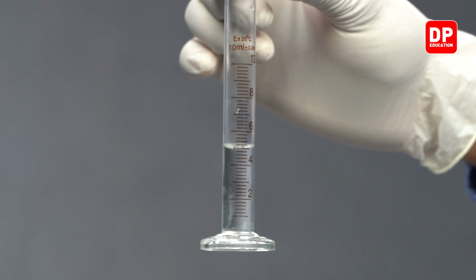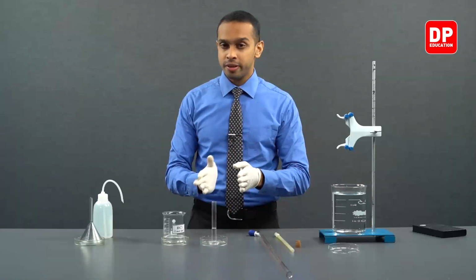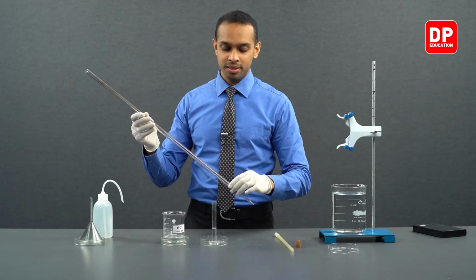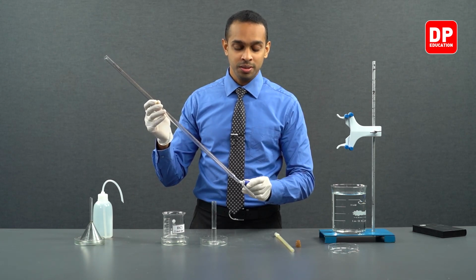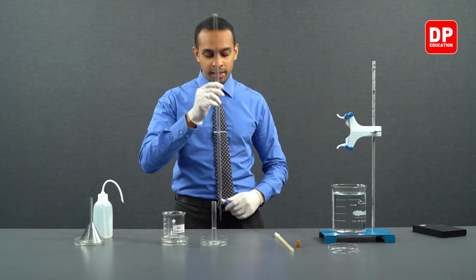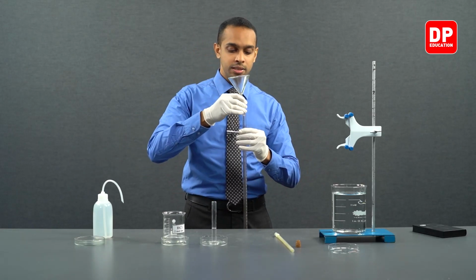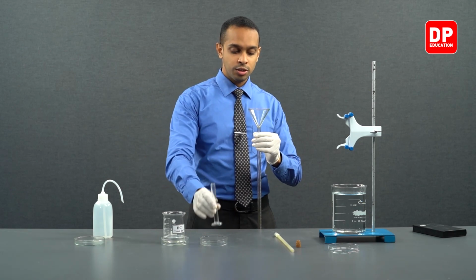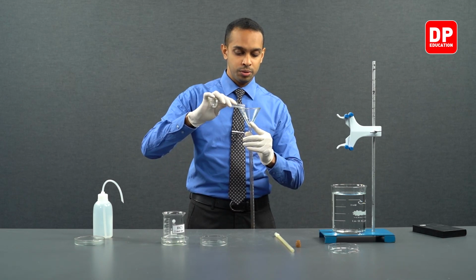I'm going to transfer this 5 milliliters into our burette. We made sure the burette is properly closed. So afterwards, we can take a funnel and place it on top of our burette and transfer this 5 milliliters of HCl into our burette.